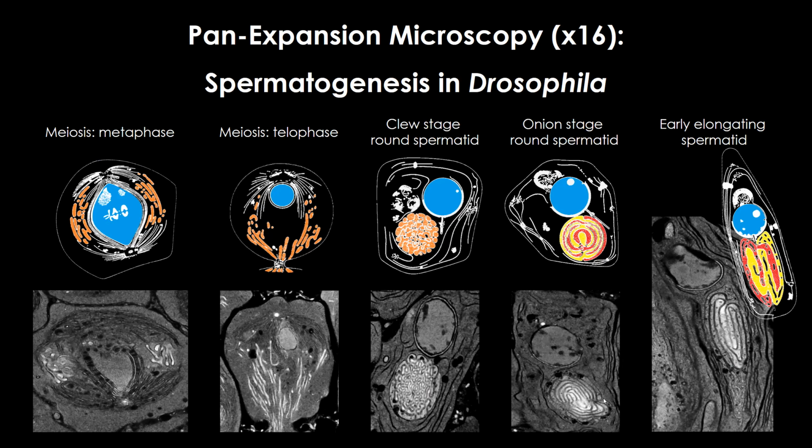It's really nice, but the downside of this technique is that most of the antibodies don't work after these extended denaturation steps.